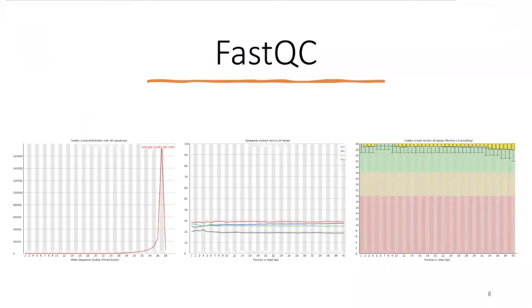So if we take a look at what it looks like, you can see that per base of your FASTQ file, so let's say you have 150 bases per read, it's going to analyze your quality score metrics and then generate such a graph. So you see, for example, the first one, and these are what it calls examples of good FASTQ files. I have to say, I've never seen this before.